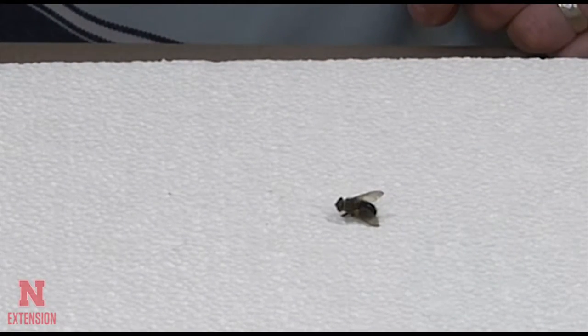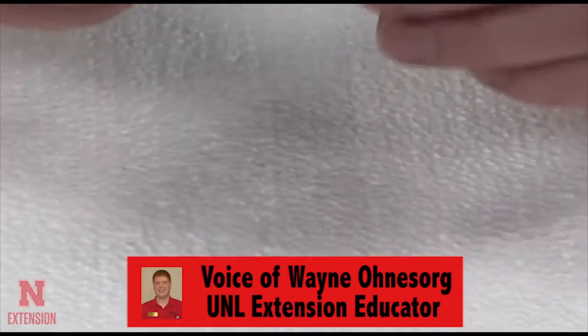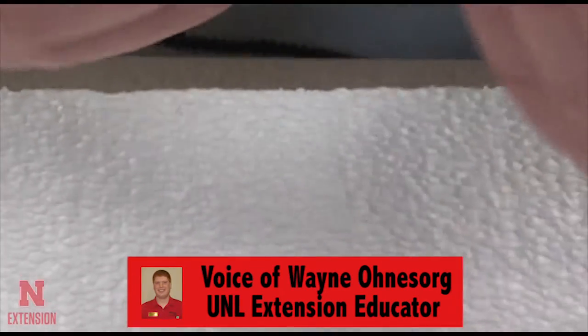Hello and welcome to How to Pin a Fly for the Nebraska 4-H program. We're going to learn how to pin a fly today.